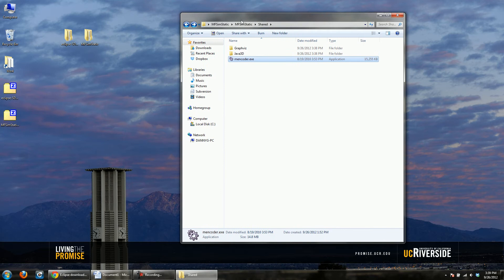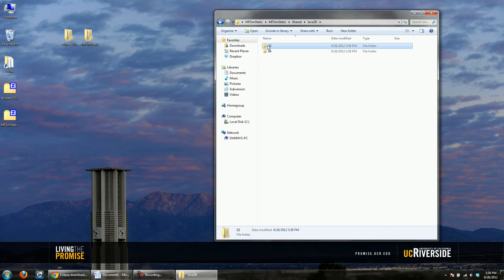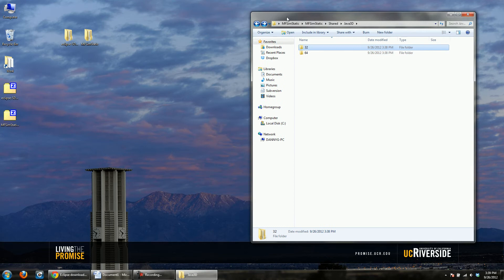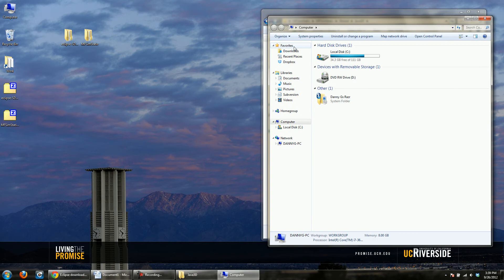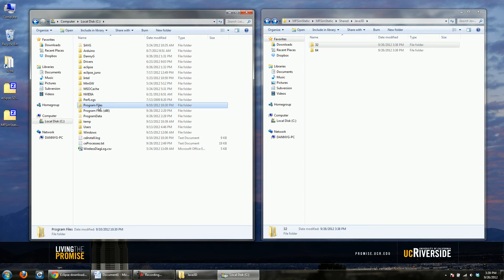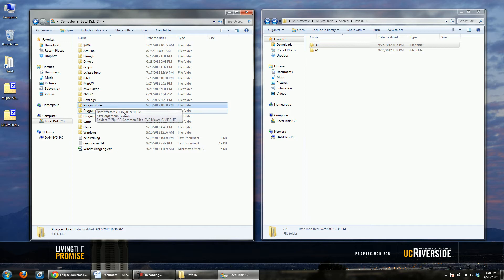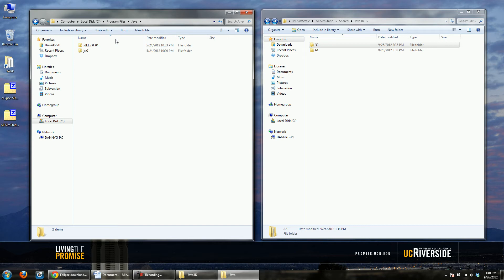The first thing we want to do is get Java 3D installed. If you open up the Java 3D folder you'll see that we have files for 32-bit Java and files for 64-bit Java. Basically what you need to do is put these files in the appropriate directories on your computer, and you'll need to make sure that the JRE is installed. Let's go to My Computer — on the C drive you'll see Program Files and Program Files (x86), since this is a 64-bit version of Windows.